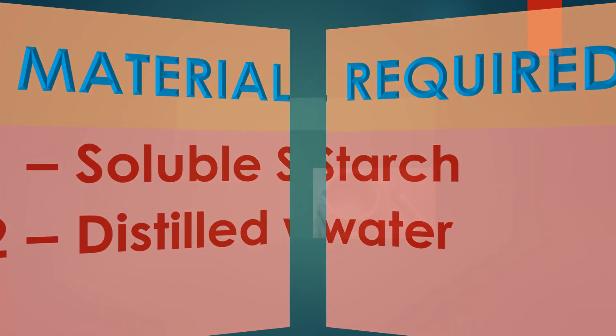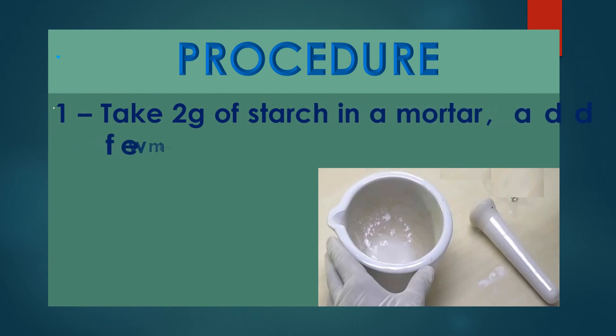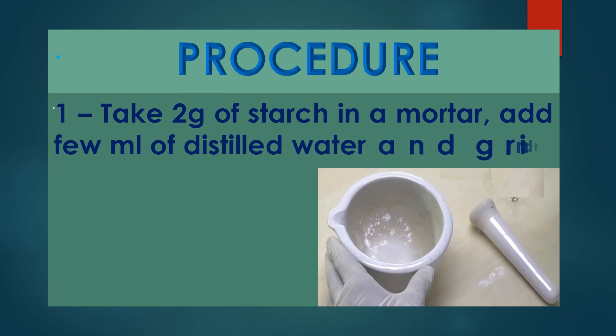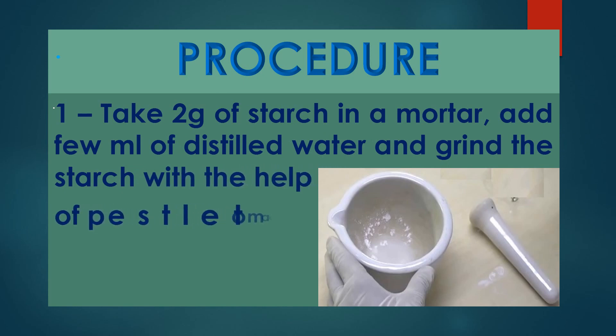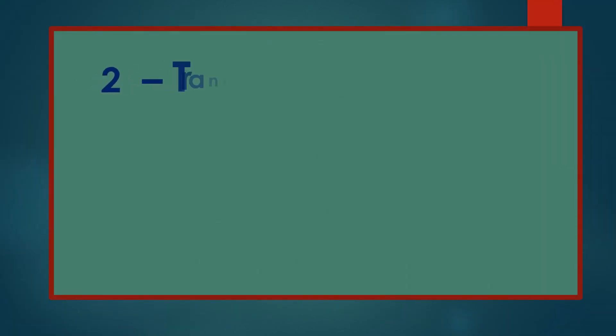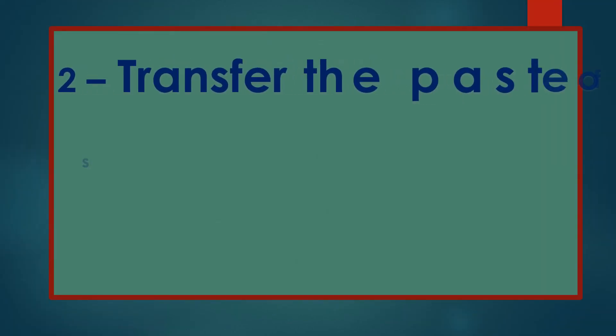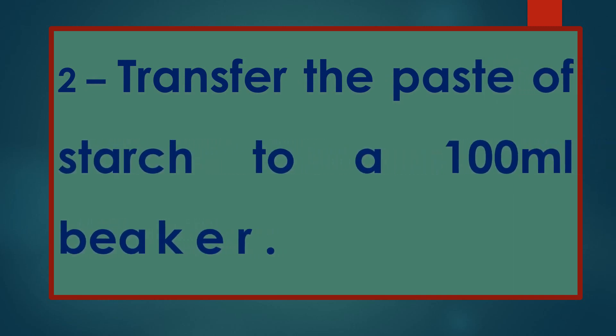Procedure: take 2 grams of starch in a mortar. Add a few ml of distilled water. Grind the starch with the help of a pestle to make a thin paste. Transfer the paste of starch to a 100 ml beaker.